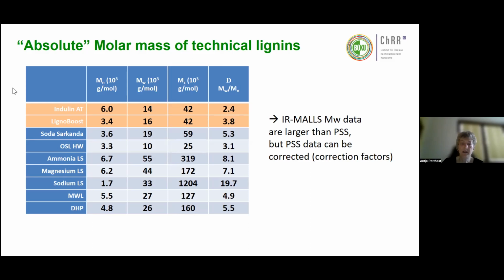And what we see, maybe just for the lignin as such, is that when we apply MALS, the absolute numbers are a little bit larger than what we usually measure for polystyrene. Sometimes it's about double. So if you measure 7,000 for polystyrene, we measure about 14,000. It depends a little bit on the setup for MALS. So lignin is not that small.